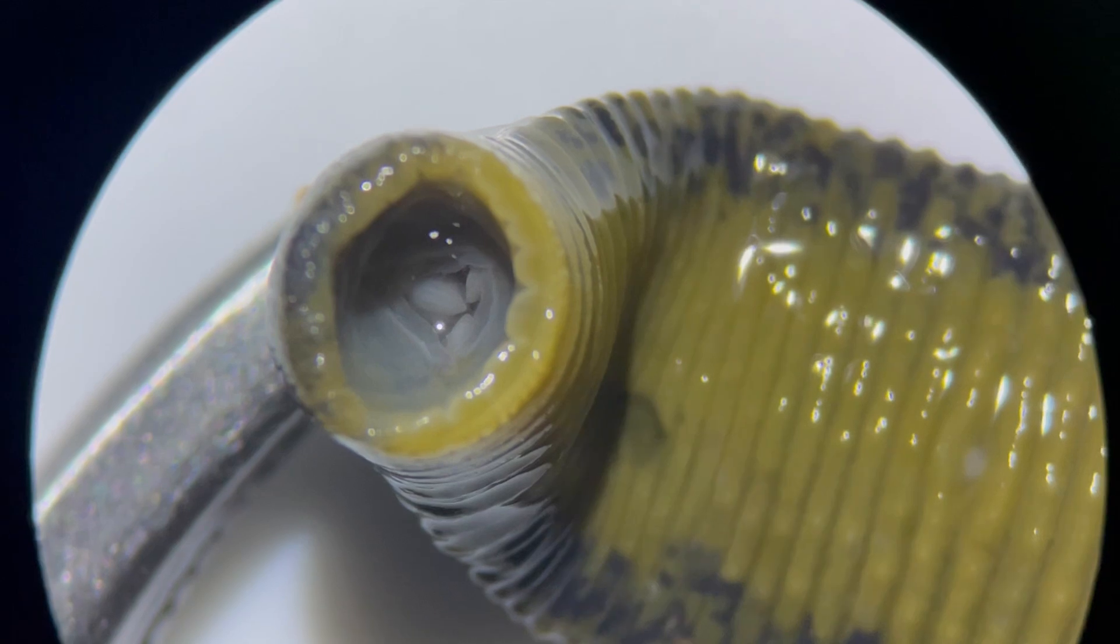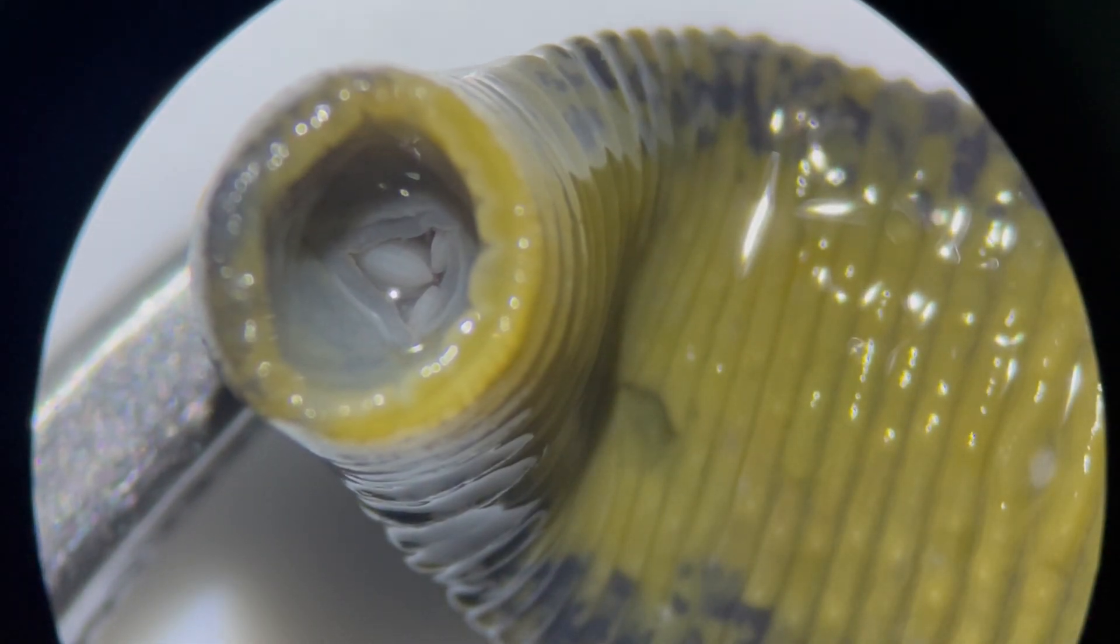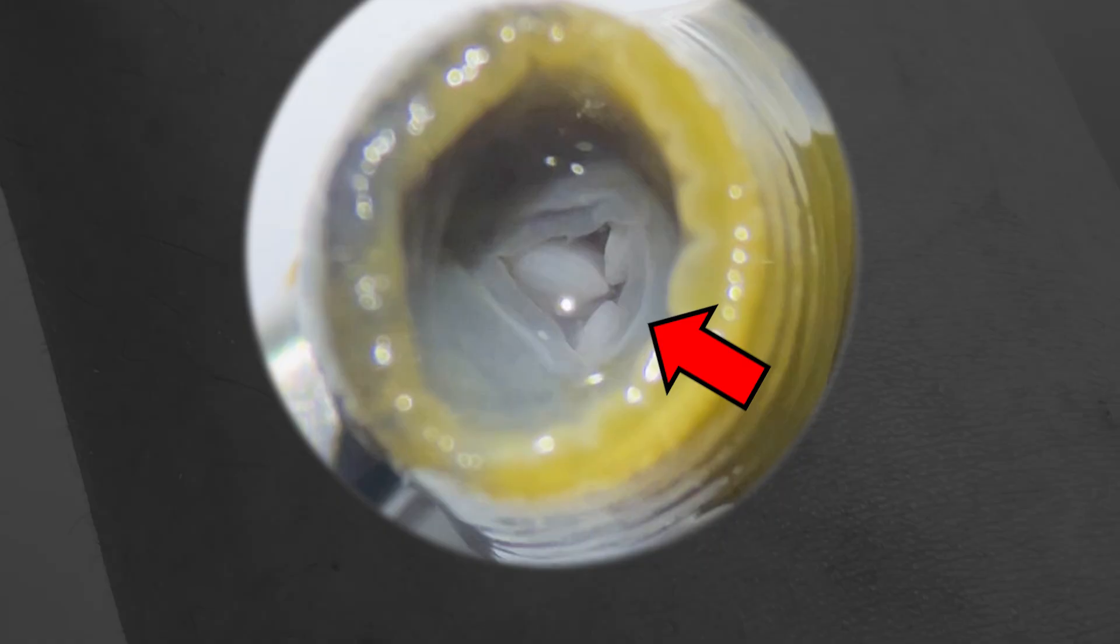When you zoom in on the inside of the mouth, you can observe three jaws. When bitten by a leech, the affected area often shows a Y-shaped mark. This mark is a reflection of the leech's jaw shape.